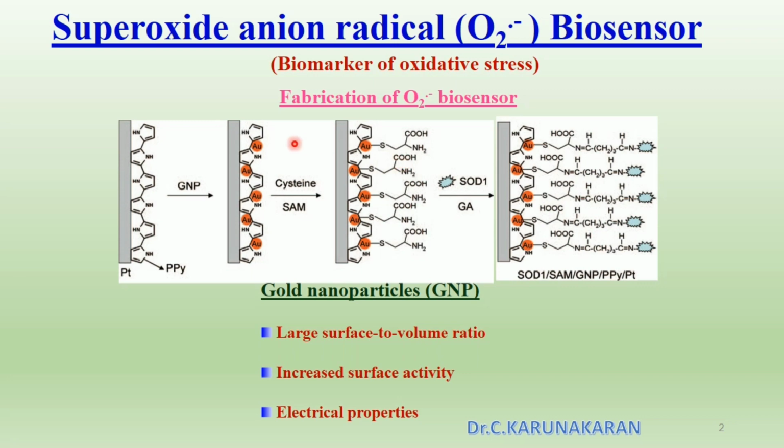In one of our recent projects, sanctioned by SERB DST, 23 lakhs, we are developing MIP based biosensors for neuronal disease biomarkers. We have also got a patent for cysteine biosensors. So I will share with you one by one the biosensors we have developed. At the end of the lecture, as I said, you will be able to develop your own biosensor. So kindly follow the lectures very carefully.